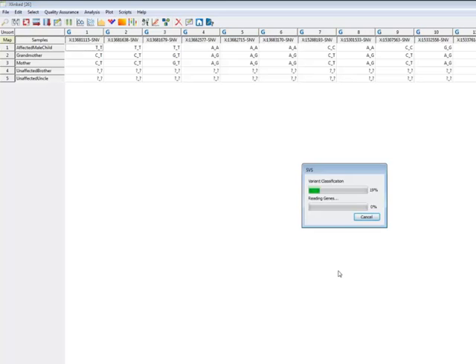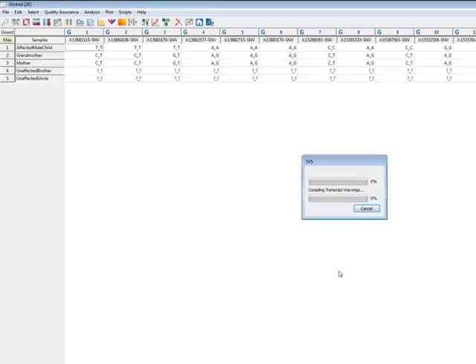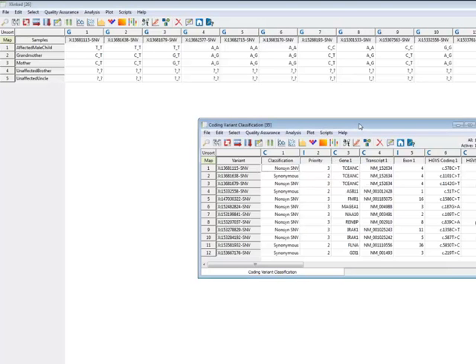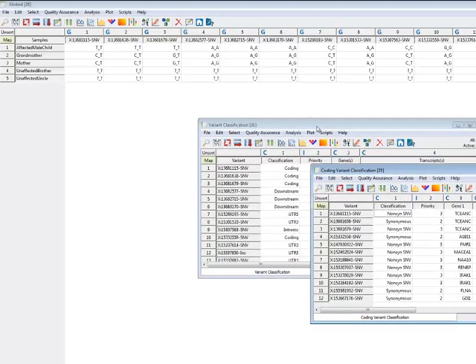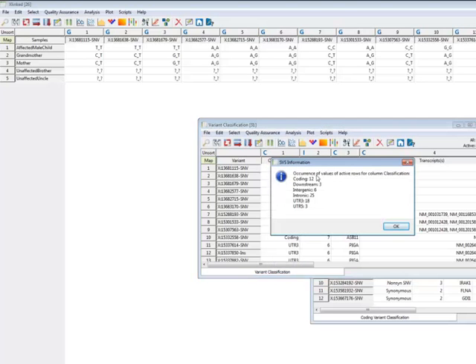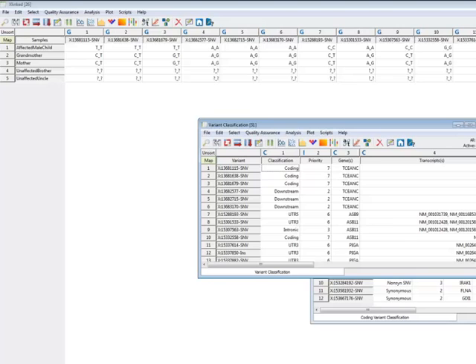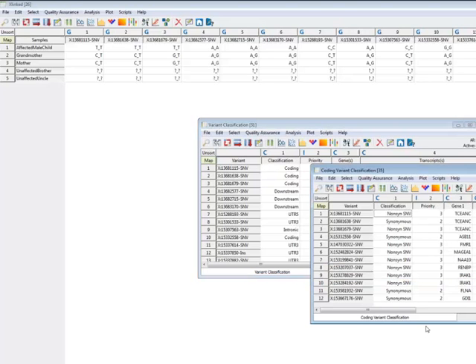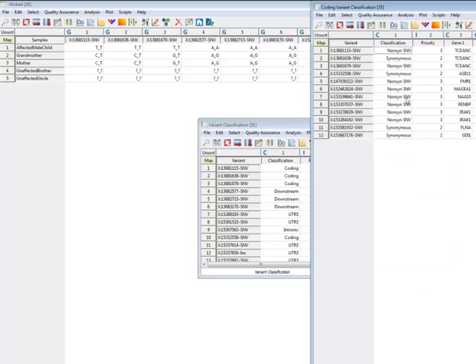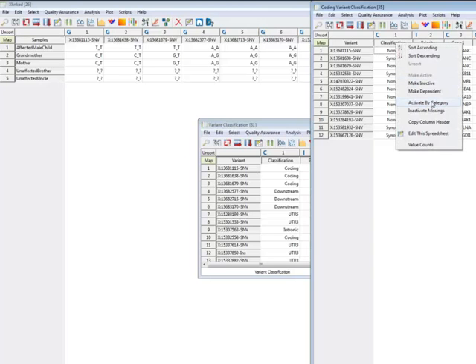So with this classifier, it'll scan through my 67 X-linked variants. It goes pretty quick. Tells me two different reports. So I can see that most of these are, well, only 12 are coding, and then there's a number that are intronic, intergenic, other UTRs, and so on. Of those 12 coding variants, looks like there are 8 non-synonymous, 4 synonymous. I just want to look at the non-synonymous ones right now.